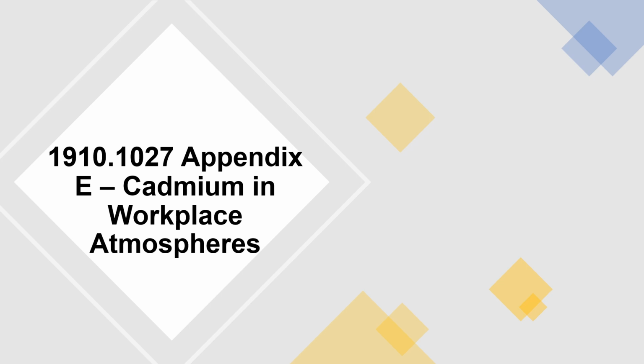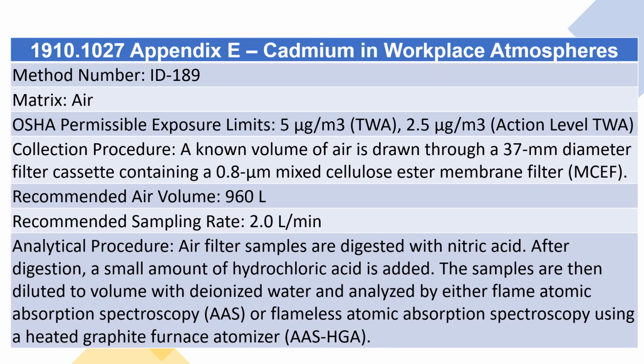1910.1027 Appendix E, Cadmium in Workplace Atmospheres. Method Number, ID 189. Matrix, Air. OSHA Permissible Exposure Limits, 5 micrograms per cubic meter, TWA, 2.5 micrograms per cubic meter, Action Level TWA.